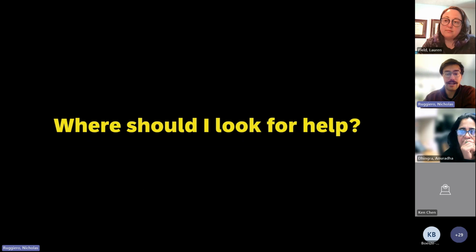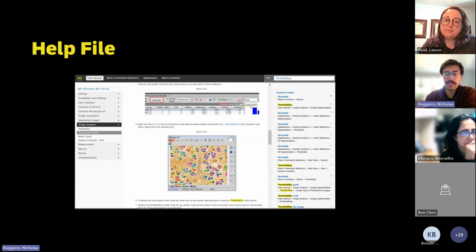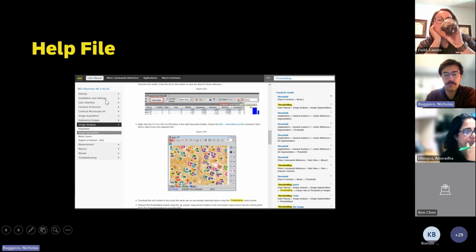The next most common question we get is, I don't really know what I'm doing, where should I look for help? The first place to look is usually the help file. We'll show you how to get that. There are a lot of places to access it. For any function that you see in GA3, you can right click on it and go to the help file, and it will take you exactly to where that function lives. It gives you a short description of what it does. It's really useful. When I was building out these GA3s, I probably used the help file a couple dozen times just because I wasn't sure what everything does. So this is one that I use all the time. There's tons of stuff in here, not just on image analysis, but plenty of other things as well.